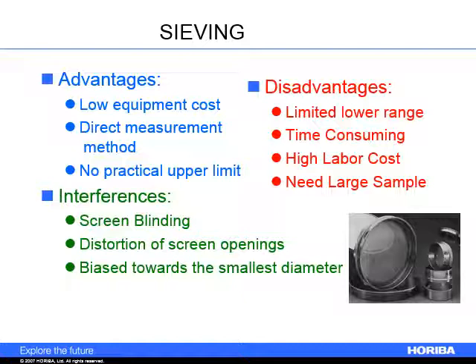If I was to take a needle that was even a foot long, or a javelin, if it was narrow enough, I could technically orient it so it would go through the sieve in the other dimension, because it happens to be of a shape that will fit through that hole when aligned in one direction. Now, in a random bounce inside of a sieve stack, that's not likely, but it would happen for a certain limit of particles, so you do have that kind of stuff happening when you're trying to take a really accurate measurement. So these are some of the issues you have.